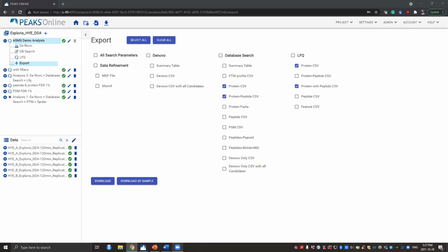So taking that into account, and hopefully it will also have two separate identifications based on the library search or the direct database search, it should then be able to get two separate peptide identifications and quantifications for those two different peptides. So I believe, yes, it should be able to do that, but of course that's going to be a difficult case.